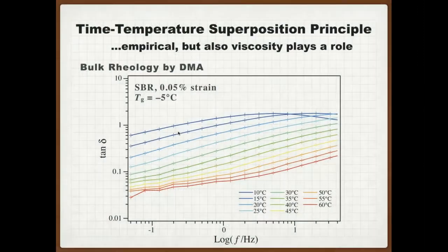Usually, we use a bulk dynamic mechanical analyzer (DMA) to analyze the viscoelastic properties, as in this slide. In bulk DMA, we give a sinusoidal oscillation to the sample and observe the responses. But the question is, the applicable frequency range is usually only about 2 orders of magnitude, which cannot fully cover the responses from the polymeric material.